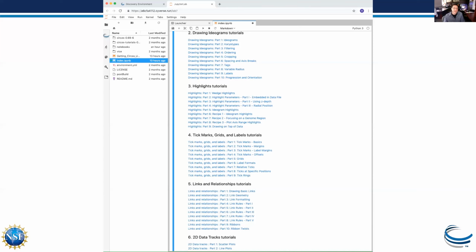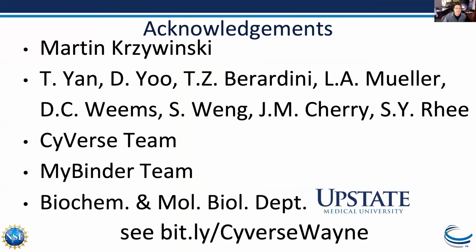There was a minor glitch that we were trying to work out remotely because Apendra, who I'll refer to in a minute, was away, and so we were trying to do this not being on the computer at the same time, and it just didn't work out. The PatMatch system, though, will look just like everything I showed you, whether you use Binder or CyVerse. But in a few days, the CyVerse version of Circos will look like this, so I have to apologize right now. But it does actually run. If you know what you're doing, you can run it.